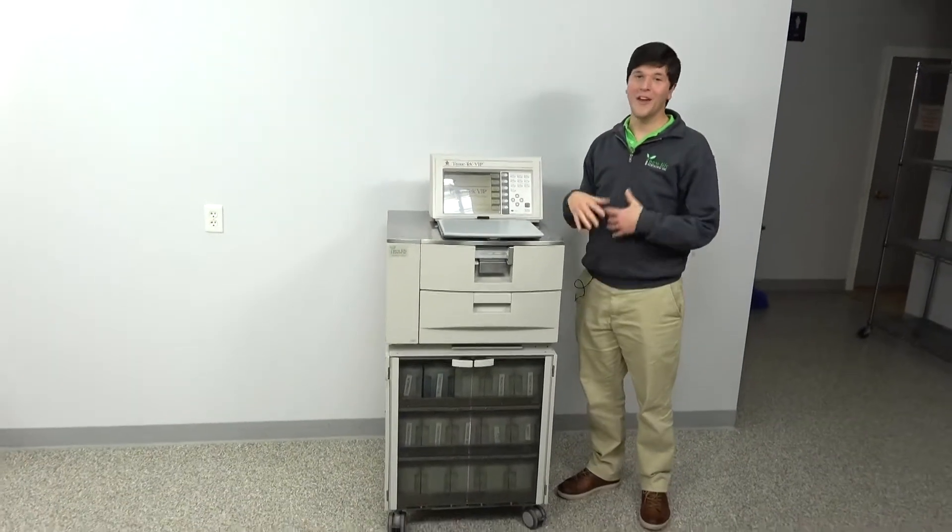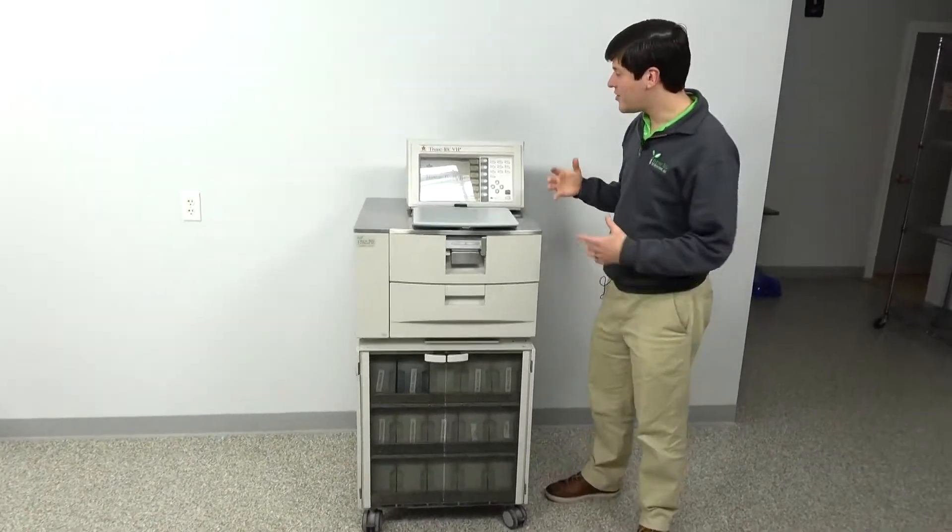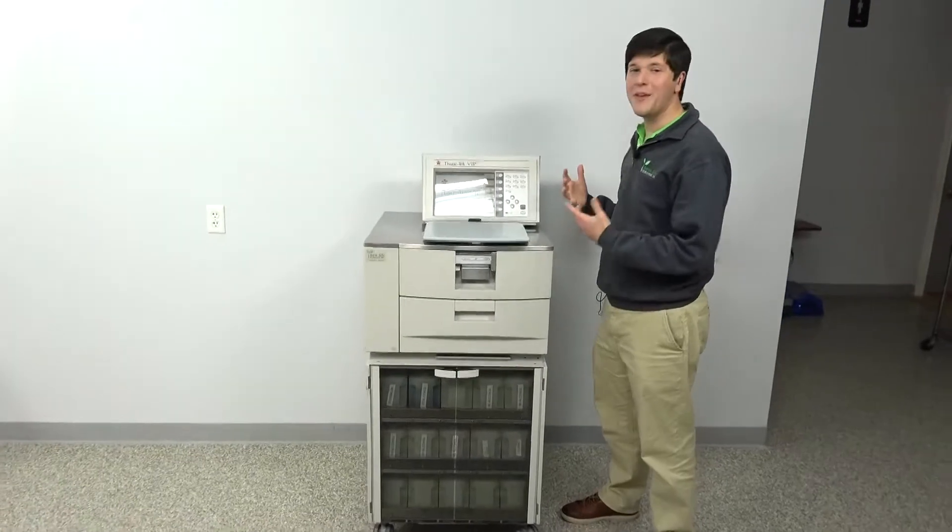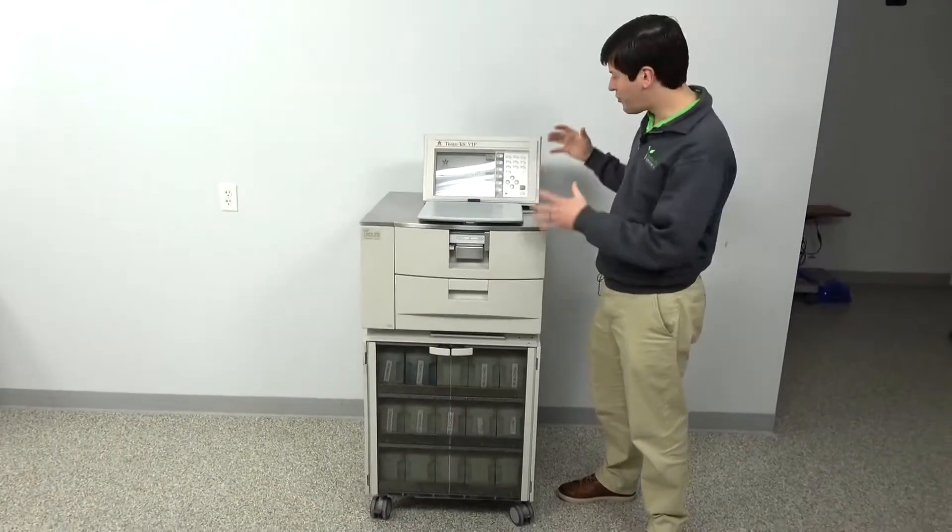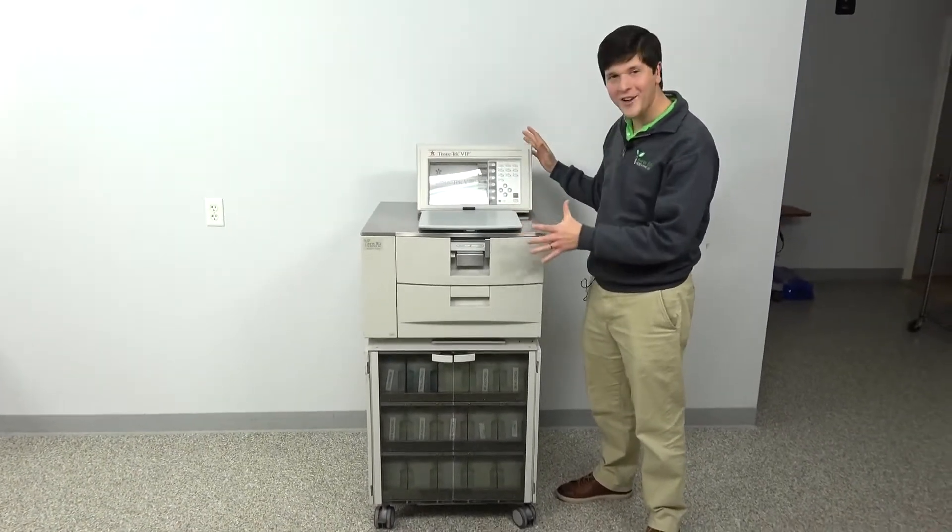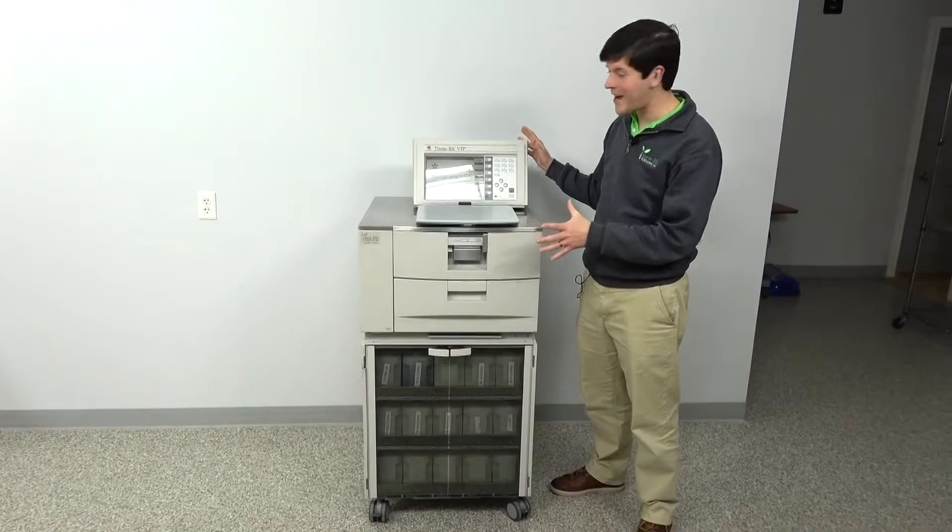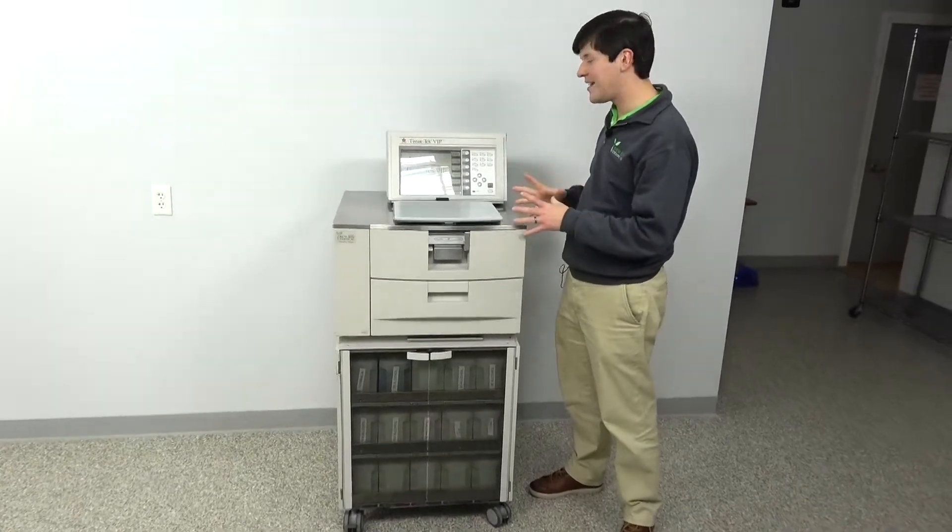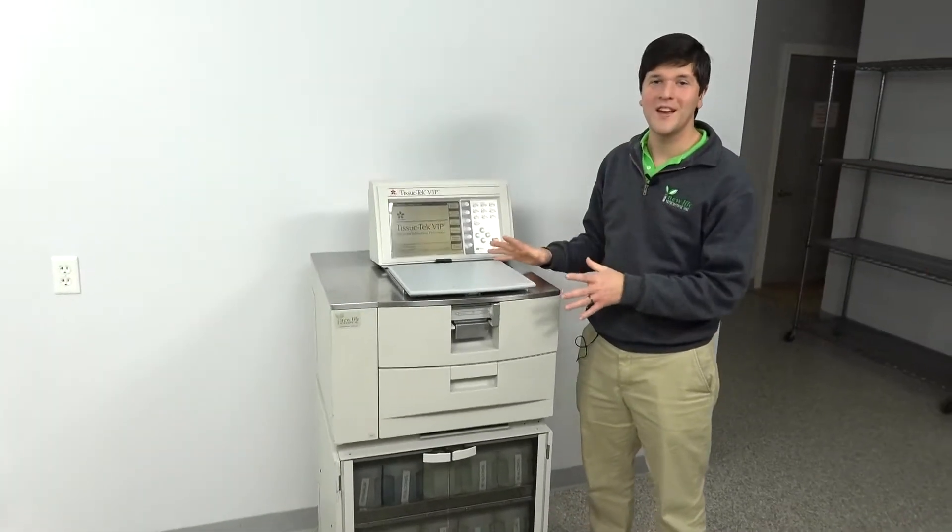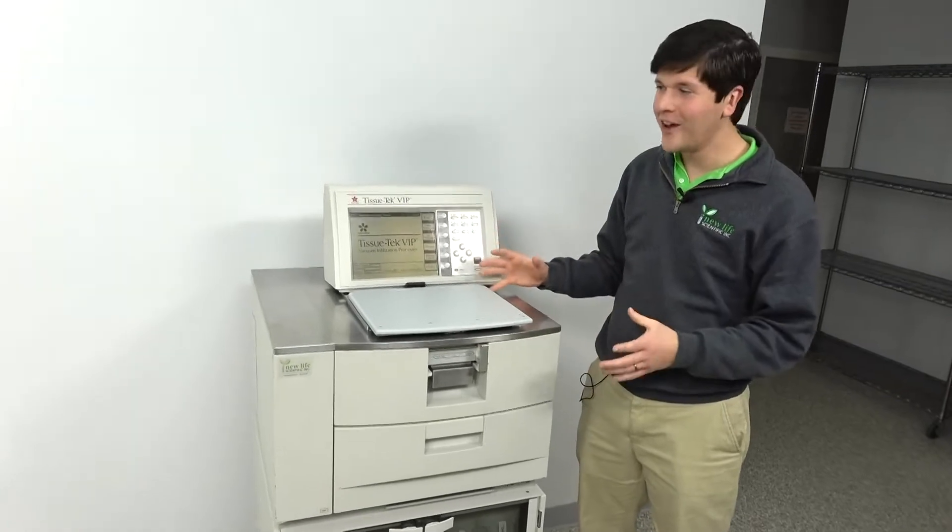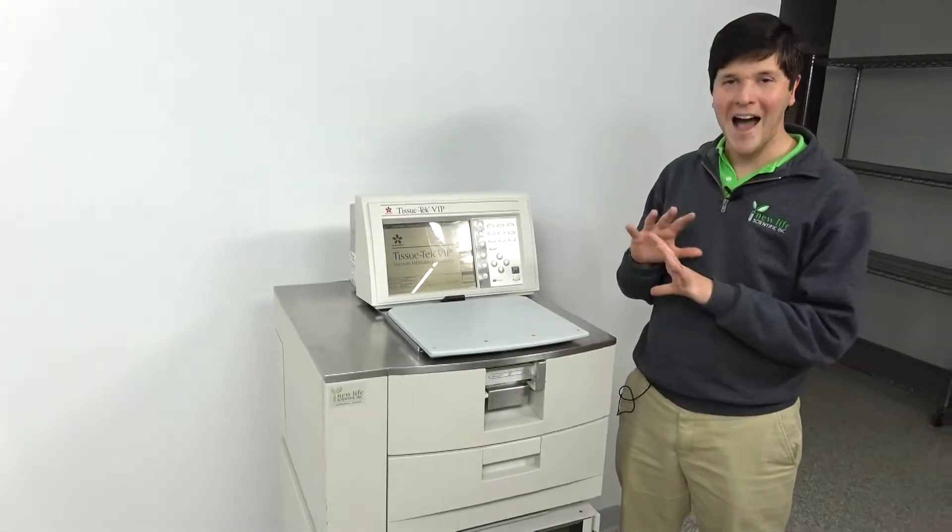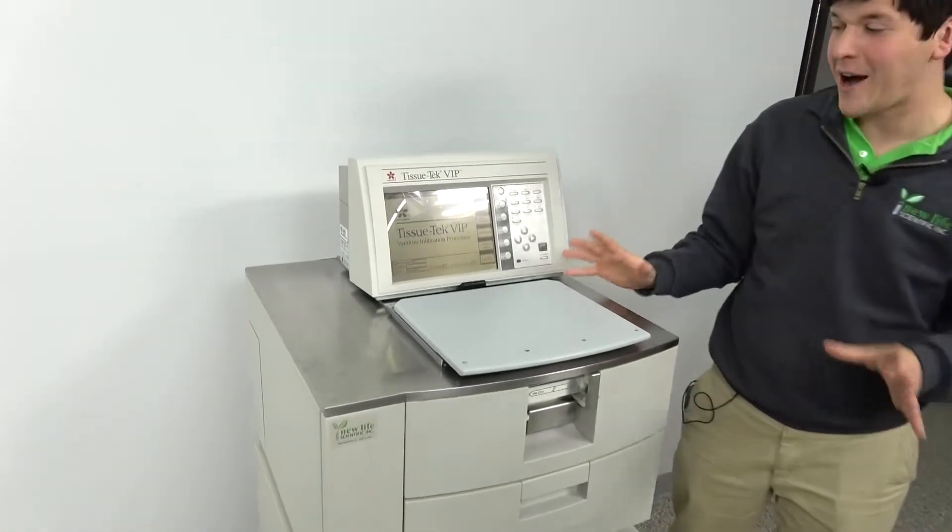For those of you in the tissue processor world, you know that the VIP 5 was a pretty significant stylistic change from the previous Sakuras, but it also represented an extremely easy to use Sakura tissue processor model, certainly miles beyond the VIP 2000.